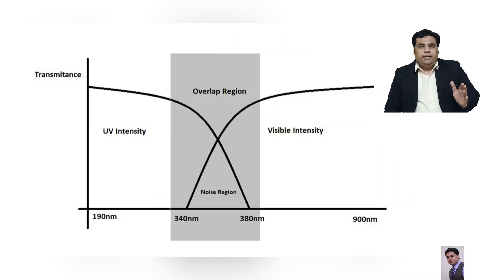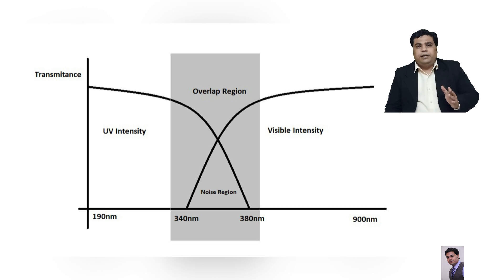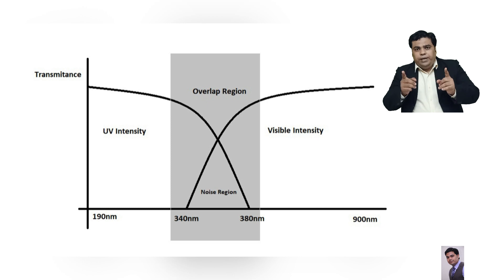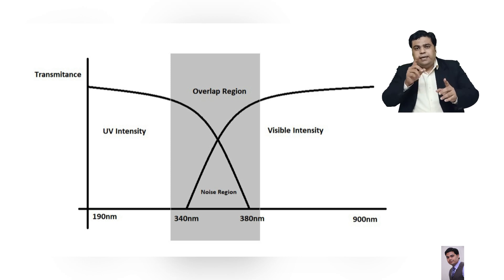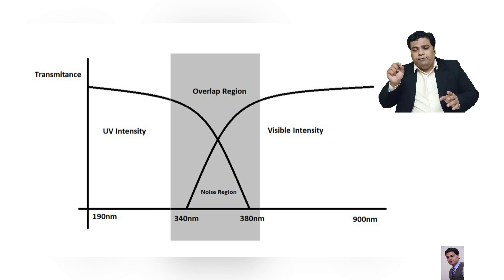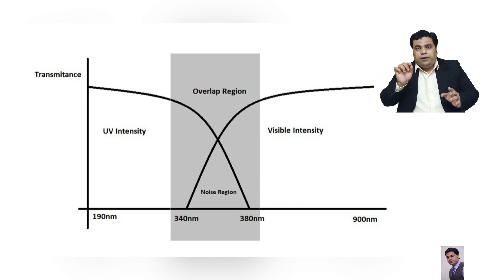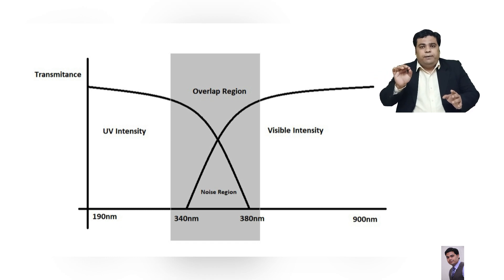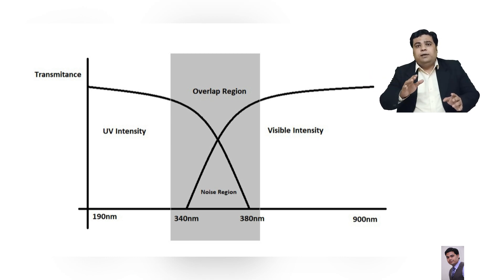The UV range is from 190 to 380 nm and the visible range is from 340 to 900 nm. There is an overlap region where UV and visible overlap — from 340 to 380 nanometers — and in this range there is a high chance of noise. If your lambda max falls in this range, you must optimize the changeover range in the software. If it is not optimized, you will get noise in this region and inaccurate results.